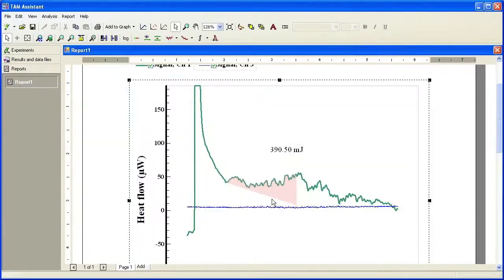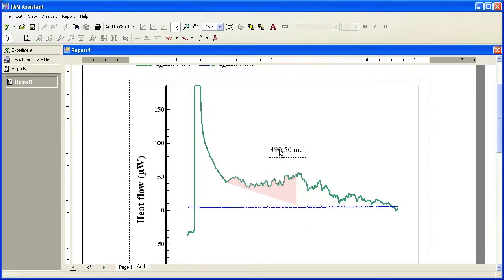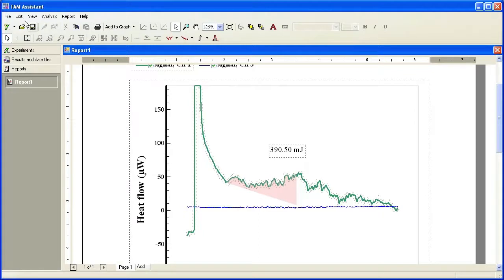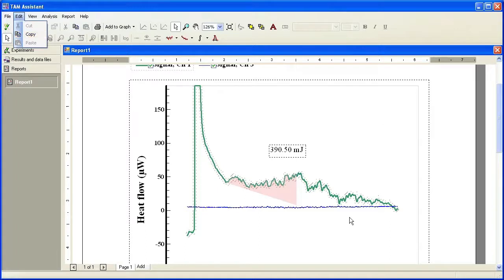And you can see here I've changed the plot color. And if you would like, now if you use a control key and you have these selected, you can edit and copy. And you would then be able to paste it into a document or a presentation program as shown here.